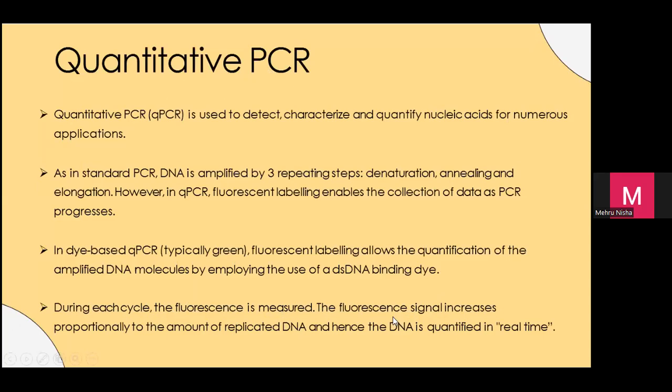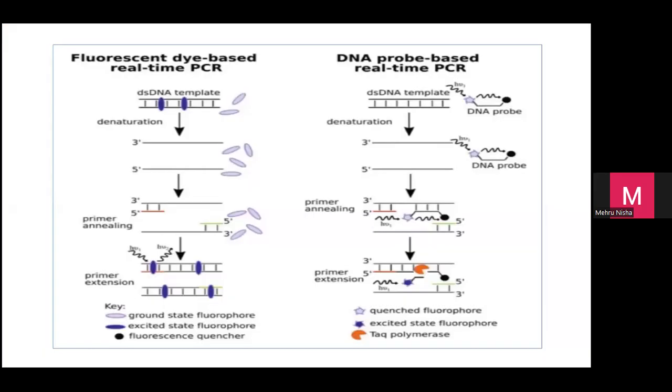That means each time, setiap kali yang dye ni pergi lekat pada your amplicon, sekarang you ada dah 10 gene lah, the amplicon. Yang ni dia akan pergi lekat pada 10 gene ni dia akan bagi warna terang. Lepas tu semakin dia PCR berlari, let's say dari 10 you dapat 20 gene. So lebih terang dye ini, lebih terang. So then you get a result. Okay, so this is how it works.